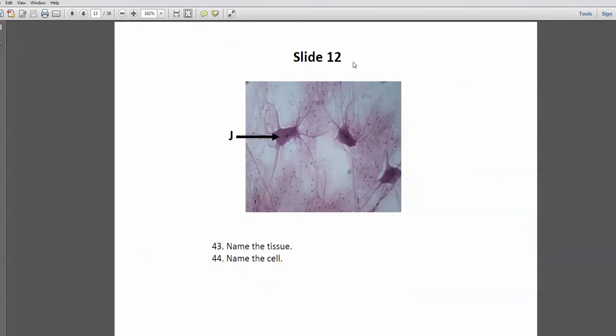Slide 12, easiest to identify tissue in the world. We have the star-shaped cells. Has to be nervous tissue.